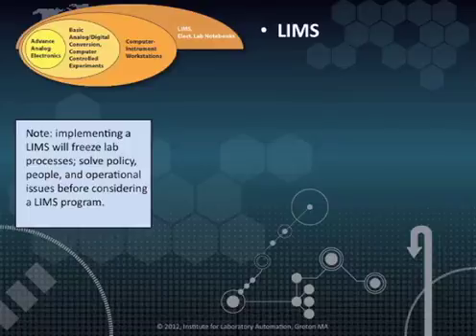One of the issues that needs to be addressed, or at least understood, is the impact that software like this can have on a lab's operations. Properly planned and implemented, it can greatly facilitate a lab's operations. However, if there are organizational problems or problems with how the laboratory operates, implementing these systems can freeze those problems into the software, because people tend to modify software to fit existing behaviors in the laboratory. Before systems like this are considered, a laboratory should review its practices and make any changes that are needed.